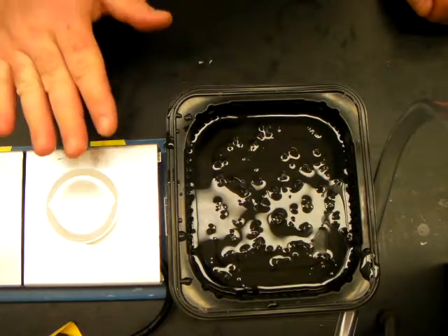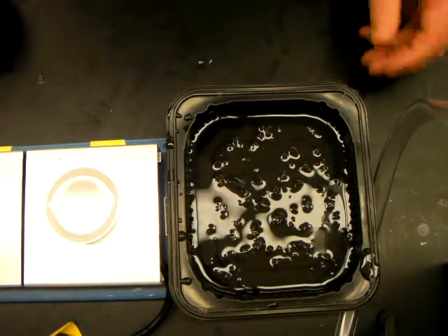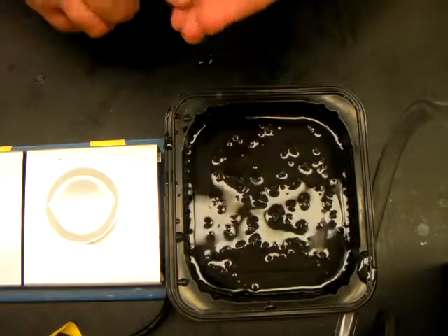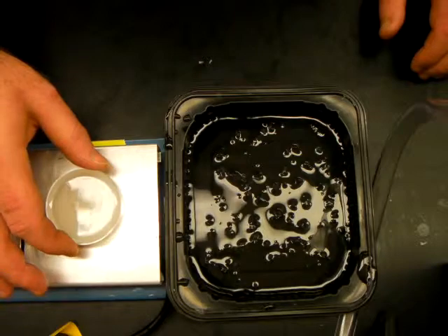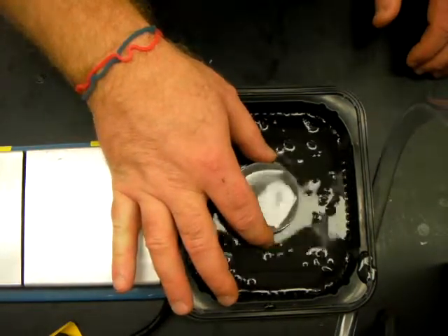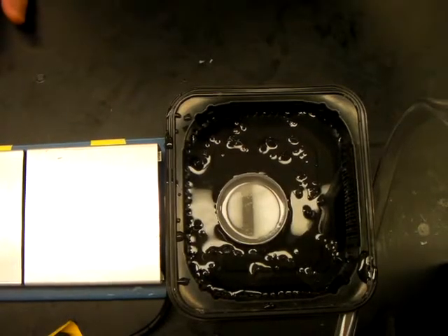We've got our specimens to the point where they're about halfway up in the petri dish, with a solid layer of paraffin underneath them. The final trick to casting — that prevents air bubbles and cracks from forming in the paraffin as it cools — is to cool it quickly. I'm going to take this petri dish with paraffin in it and lower it into this ice water bath to cool it very rapidly.